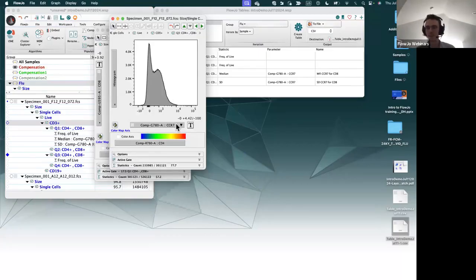It's a pretty poor definition of what a geometric mean is. But basically, you could think of it as the mean of the scaled data, versus a regular mean, which would just be the mean of the raw data, which would be skewed in a logarithmic scale very far to the right.